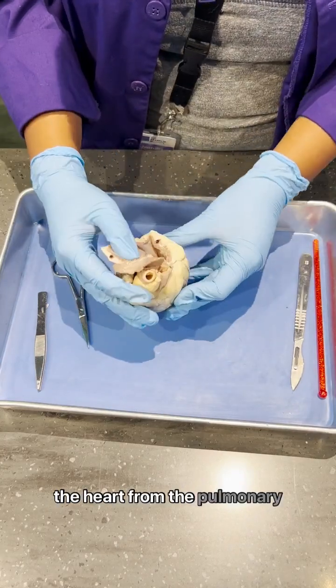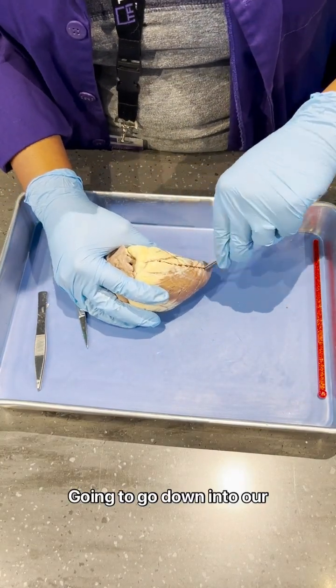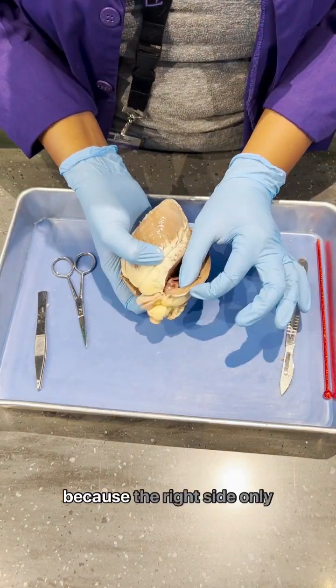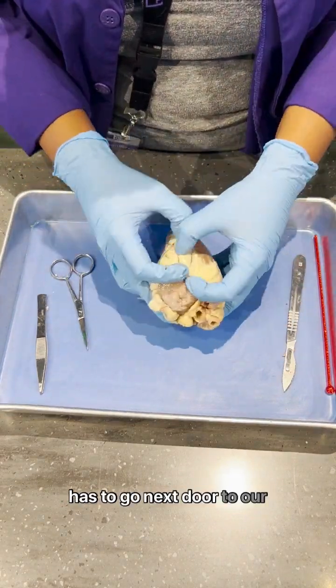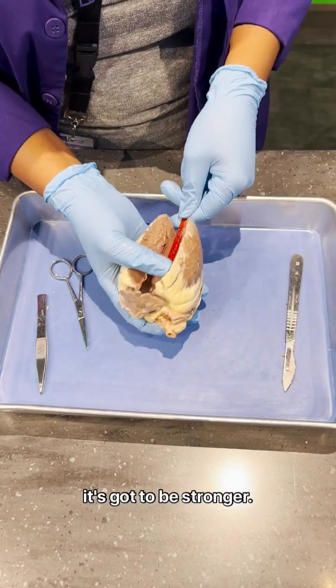Then we're going to re-enter the heart from the pulmonary vein and go into the left atrium, then go down into our left side. We can see that the left side is really thick because the right side only has to go next door to our lungs, but the left side has to take blood to our entire body, so it's got to be thicker and it's got to be stronger.